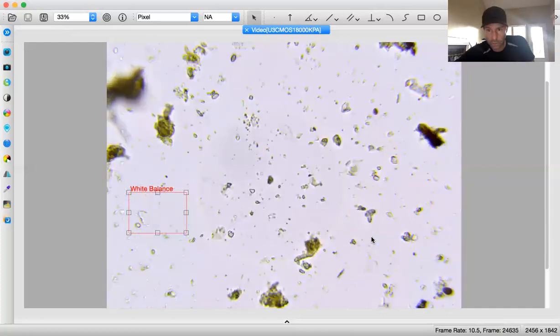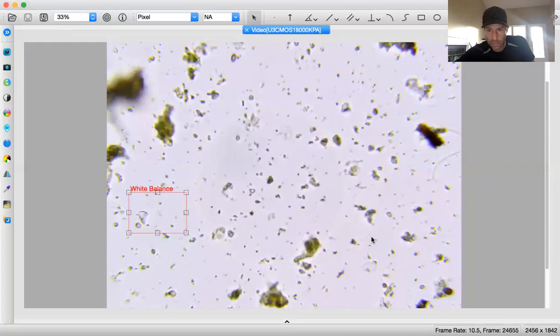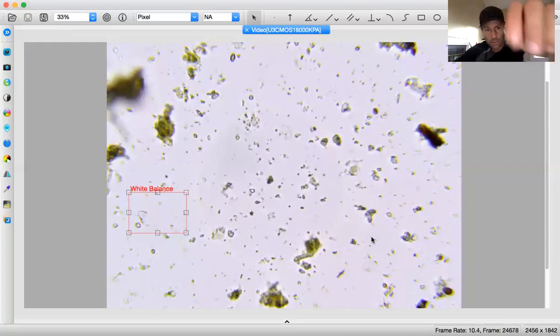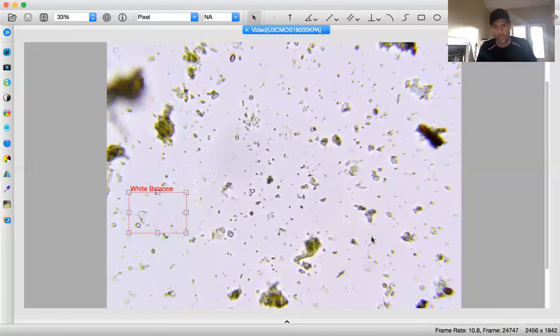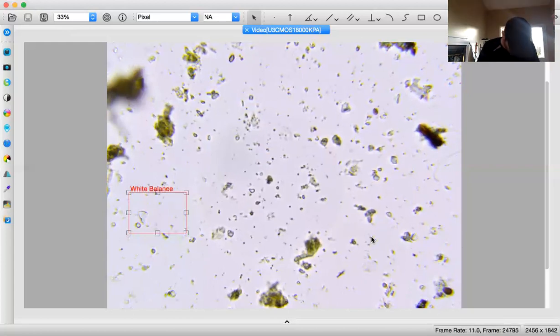Ooh, what we got? There's some actino on the side. Ooh, goodness. Looky there. Significance. That's a 1 and a 1.5. So that would be a 2.5. That's 0.25 on actino.